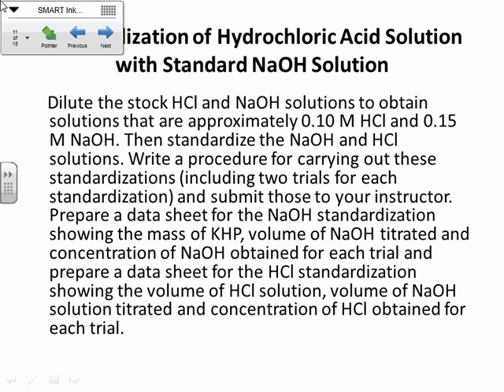So after you have these two things standardized, now I should step back, because I think the one thing that I didn't say on the last video was explain what exactly the standardization process is, and that's kind of important. When we start doing the Tums and the Rolaids, when we're testing those, we need to know exactly what concentration of NaOH and exactly what concentration of HCl we're actually dealing with.